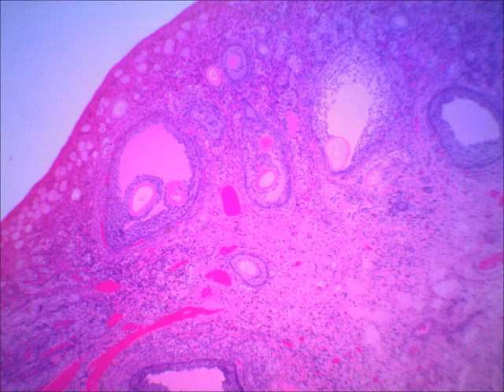Now, the next slide that I've got in your series here. It's a different slide of the ovary with different stains, but I don't want you to memorize colors. I want you to look at the particular features. I'm sure on this slide you can see just under the surface lots of these primordial follicles right there, right here, all along the surface. Okay, and then you see other follicles in various stages of development.